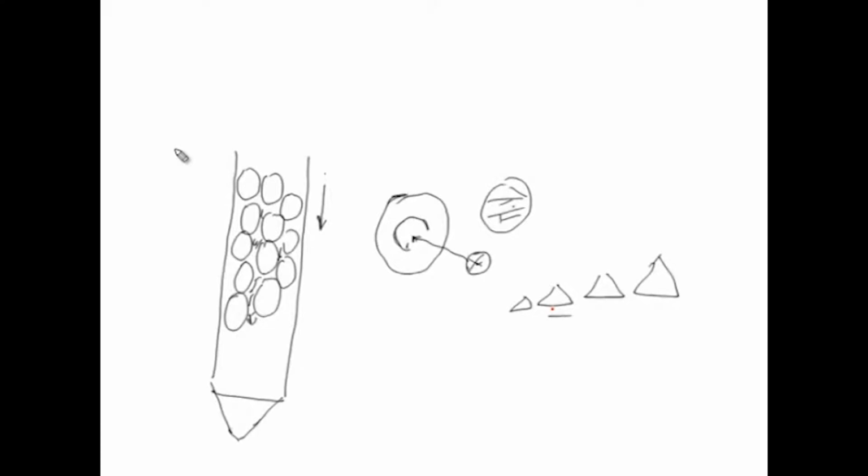So, that is how the separation occurs, because they are moving down, as you have a continuous flow system, at different speeds or at different rates, which means they are eluted at different rates. So, this is a very simple basic principle of column chromatography, of gel filtration chromatography.